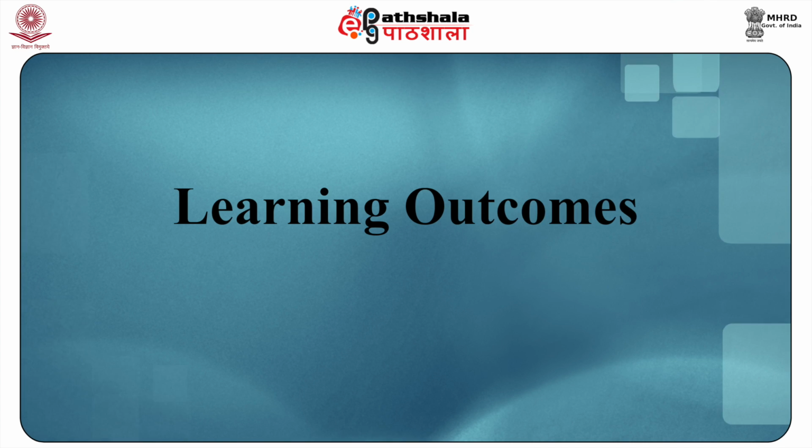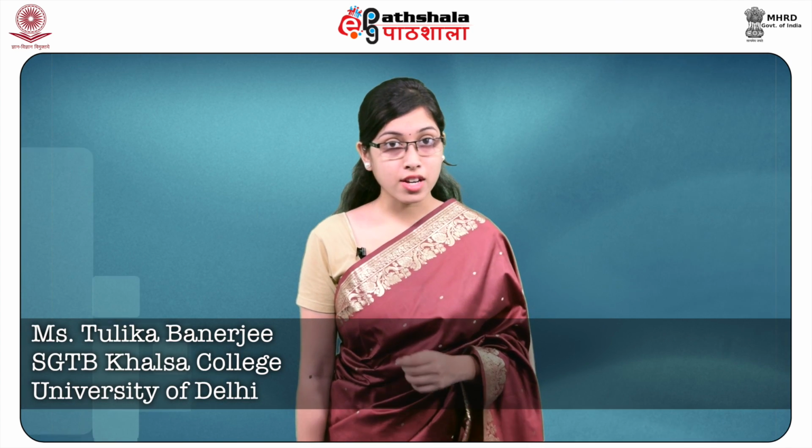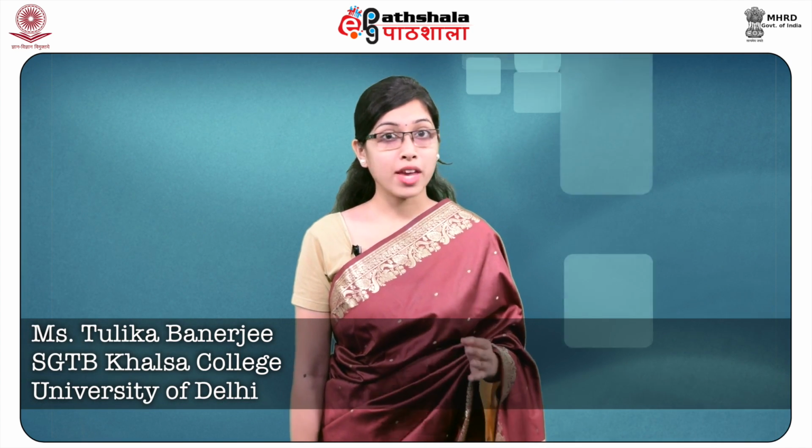Learning outcomes. Dear students, after studying this module, you shall be able to know about the principle and basics of electrophoresis and buffer systems, learn about gel electrophoresis, its role in resolving nucleic acids and proteins, its modifications and staining procedures. Evaluate the analytical difference between resolution of nucleic acids and proteins.